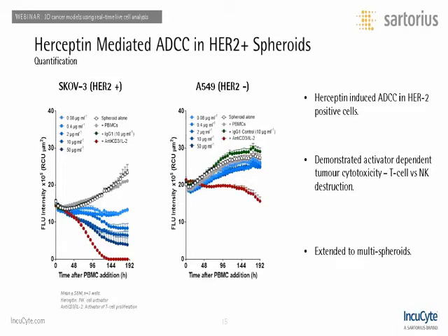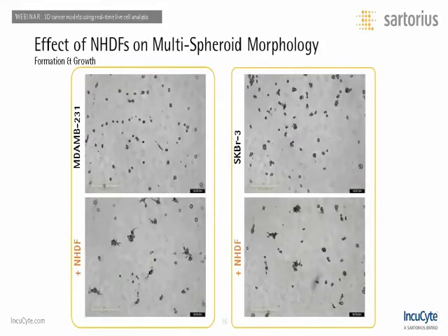We've also gone on to show how there is an activator dependence on tumour spheroid cytotoxicity, where kinetics of death between different subpopulations of immune cells occurs. So, for example, we've observed that T-cell mediated death via the activation with anti-CD3 and IL-2 occurs more rapidly than NK mediated death with a different range of activators. But it's also worth reminding ourselves that this may reflect potential differences in the concentrations of subpopulations of these immune cells in the PBMC prep, and also take into account potential donor-to-donor variations.